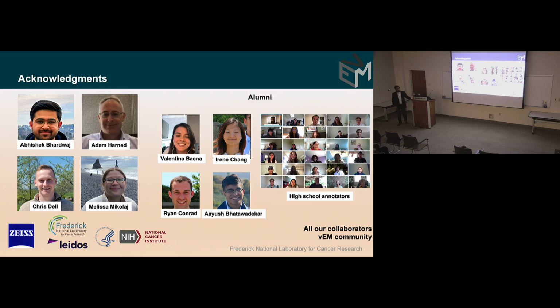I was wondering why you chose to do the instance segmentation, because clearly it worked, but in my head I would have thought it would have made generalization harder, because it's trying to say this mitochondria is its own class. And then I would have thought unless you get that exact same shape mitochondria. Ah, good question. The way it worked, I didn't get into details of this. The model is actually something called Panoptic DeepLab.